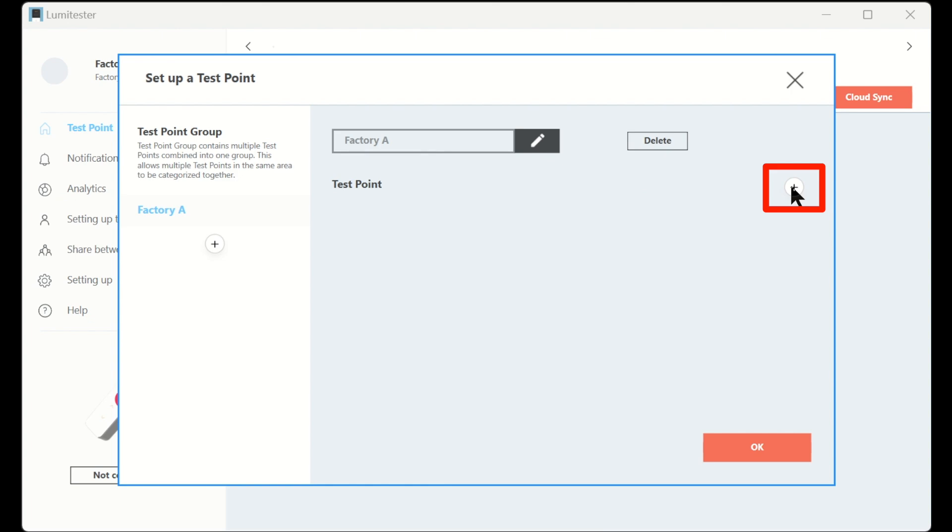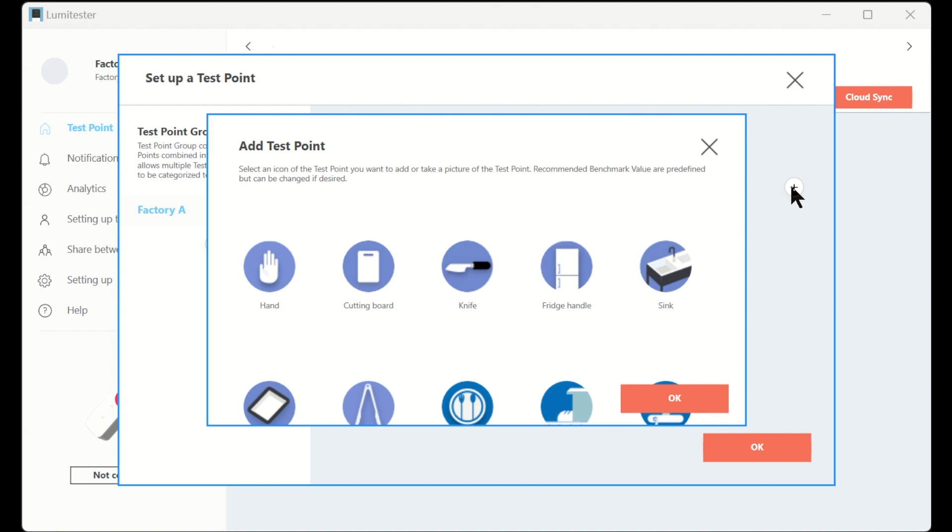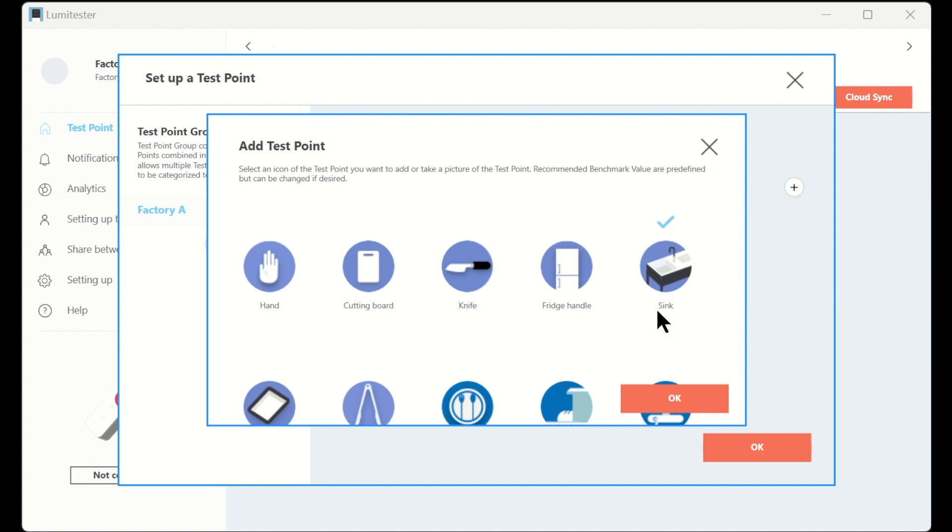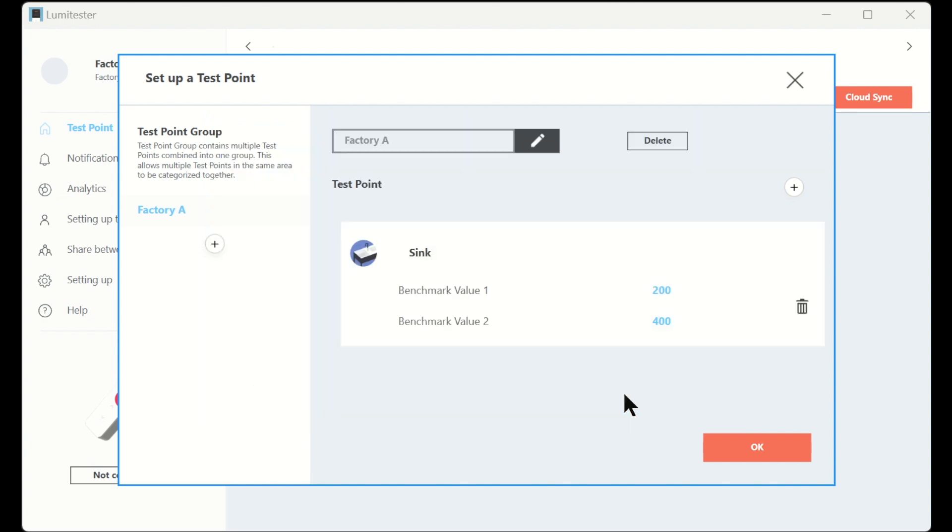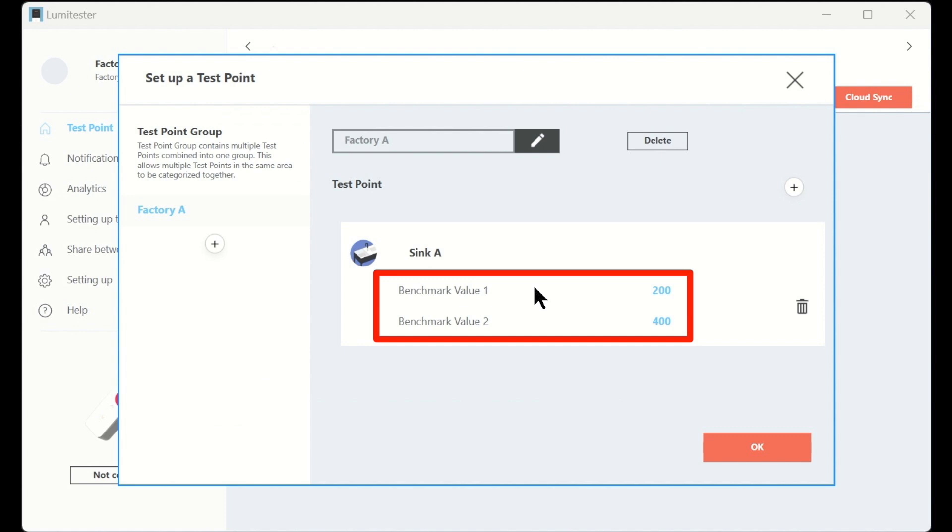Next, let's set the test points. Click or tap the plus button on the right, select the icon you want to use in the pop-up screen, and click or tap the ok button. Each icon has a preset name, and you can change it by clicking on the name. In this case, we'll name it sink A. Recommended benchmark value will be pre-populated, also it can be changed.